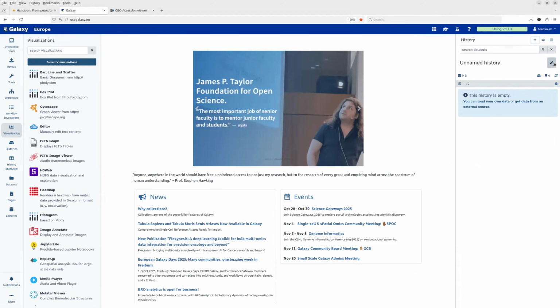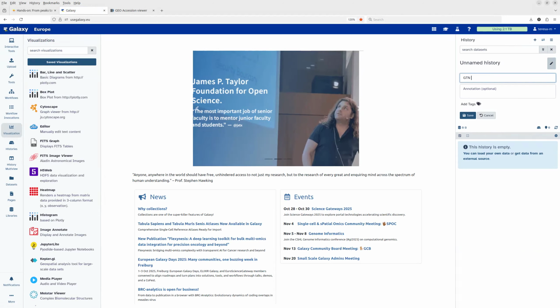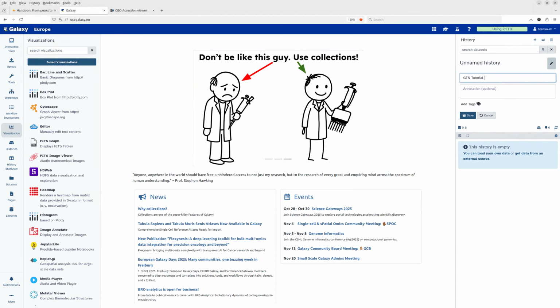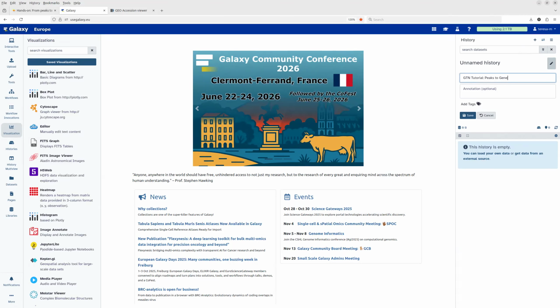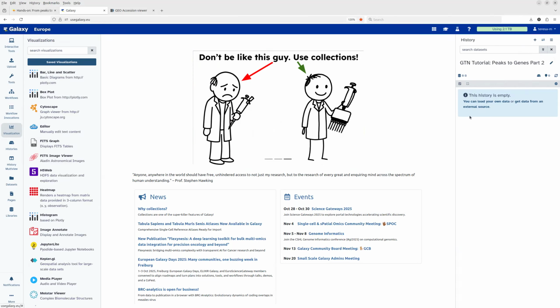I can rename this history to GTN tutorial peaks to genes part 2, or more sophisticated part, whatever you want to name it. And then I click on save and I have a new fresh history.